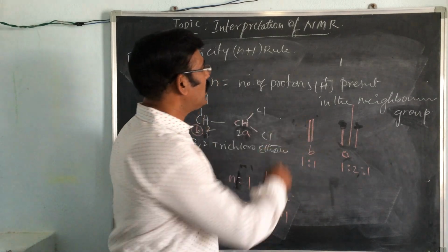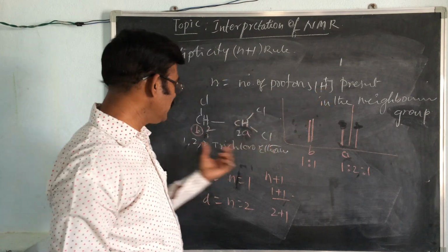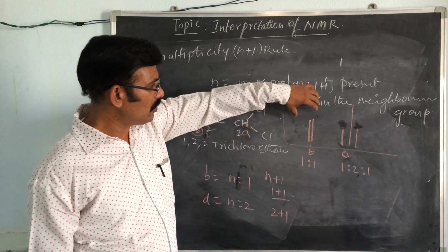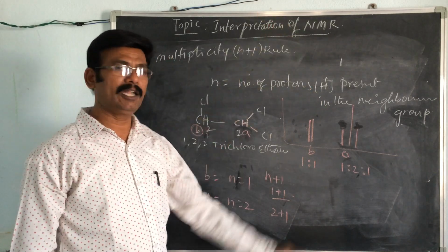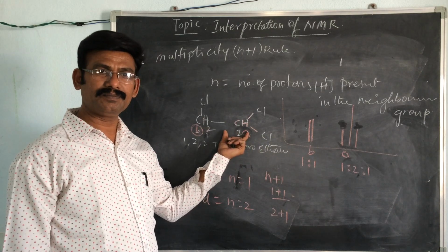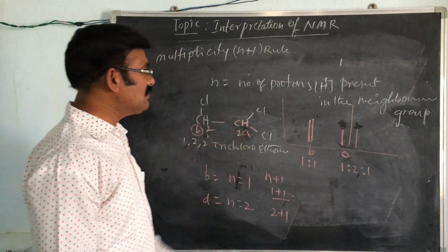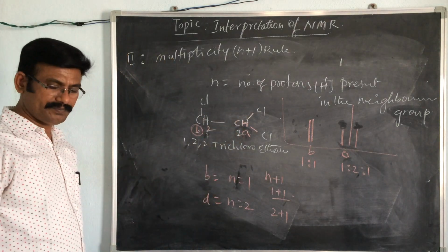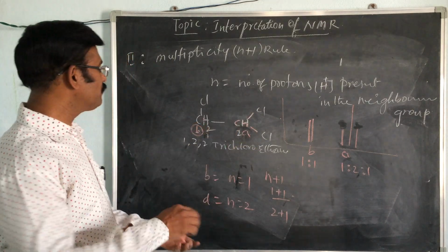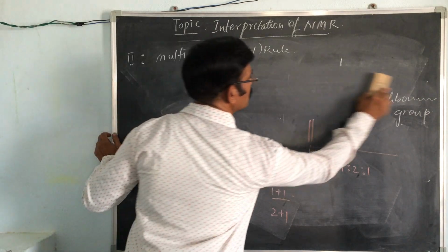If you know that spectra containing like this one, so here, B is the one, doublet will come, and A is the triplet will come. So first environment, then multiplicity. Okay, multiplicity, this is the best example. Now, last one is the chemical shift. If you want, I will give one more example. Okay, we'll look at the one best example.